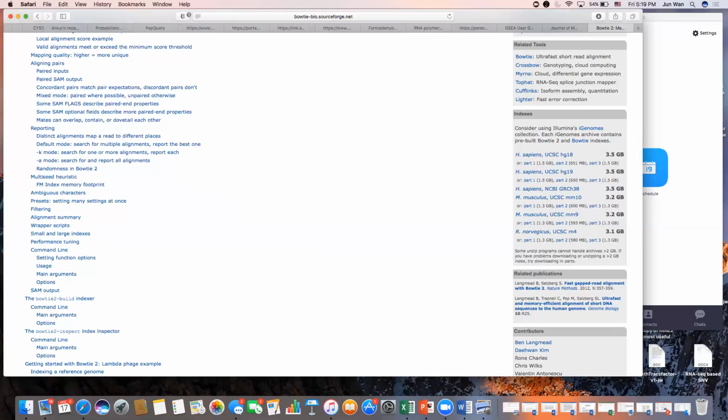I did that this week. I used a couple of different ways. I used it from NCBI. I used it from UCSC. It takes a while. My concern is that some of you have faced wall time in the past, and I'm afraid you'll time out. I don't want you to get halfway through. I don't want you to get, say, 15 chromosomes in and it quits. So take your time with it, but be aware, if you do build for your own project here, there may be wall issues.